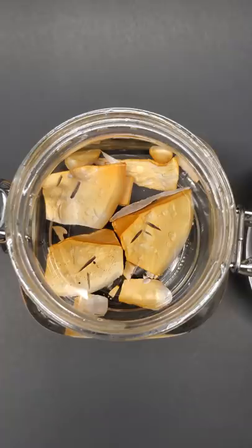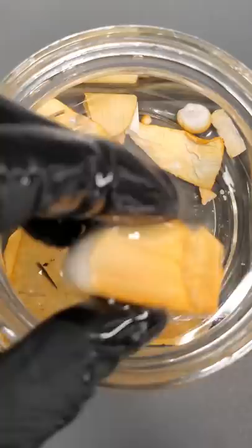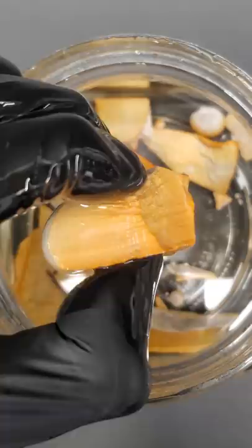This is sodium metal. It's stored under oil because it's very reactive to moisture and air. Most metals are hard, but sodium metal is really soft, and you can squish it just with your fingers if you squeeze really hard.